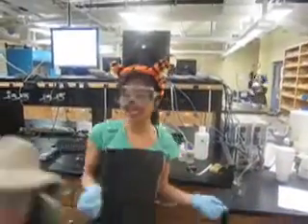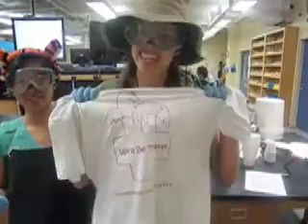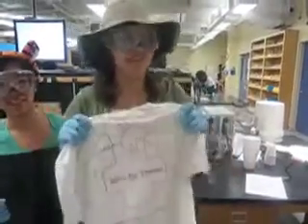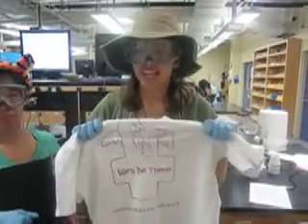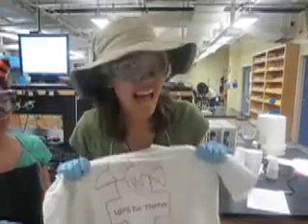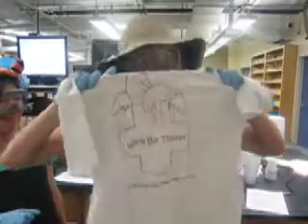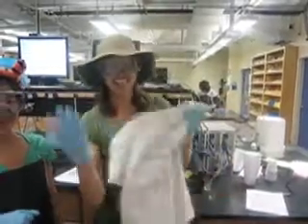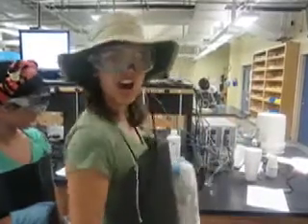Wow! Hey kids, by the way, here's a great way to remember which one is the anode and which one is the cathode. When the potential voltage reads positive, then the red side is the cathode, and the black side is the anode. You can remember this because Kathy, as in cathode, was in the red cross, as in the red side of the cross, which is positive. And now let's see if we can make the battery work and attach it to our car.